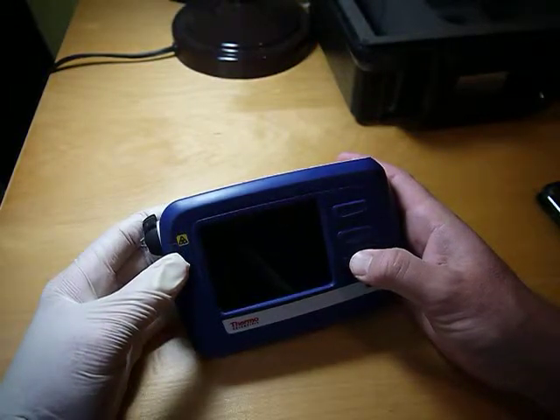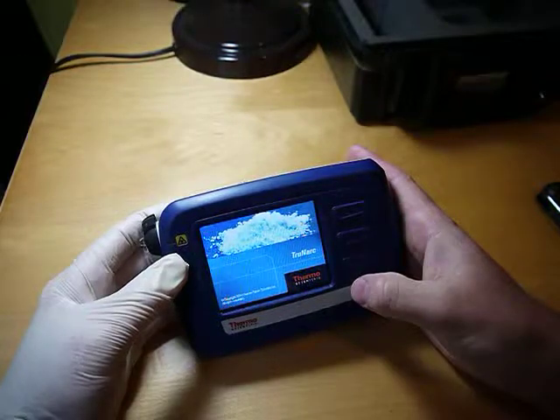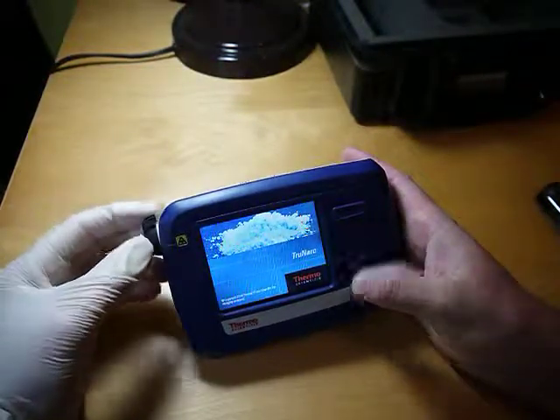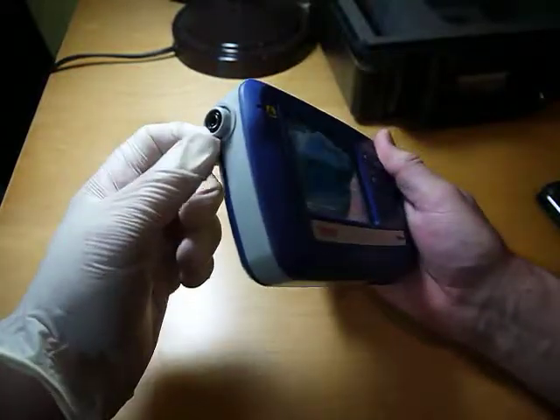So I'll turn this on. This is the on/off button right here. It's going to start booting up. It uses a laser — the laser is under this cover, I'll show you right now as it's booting up.